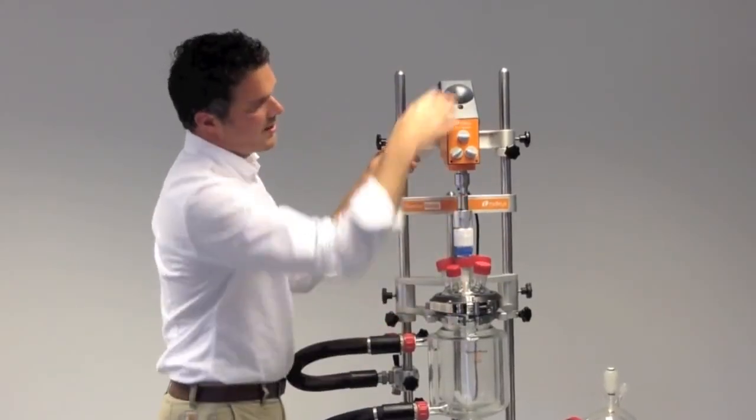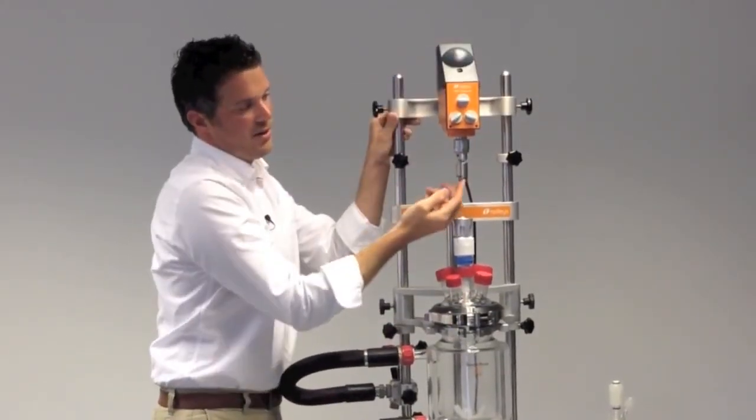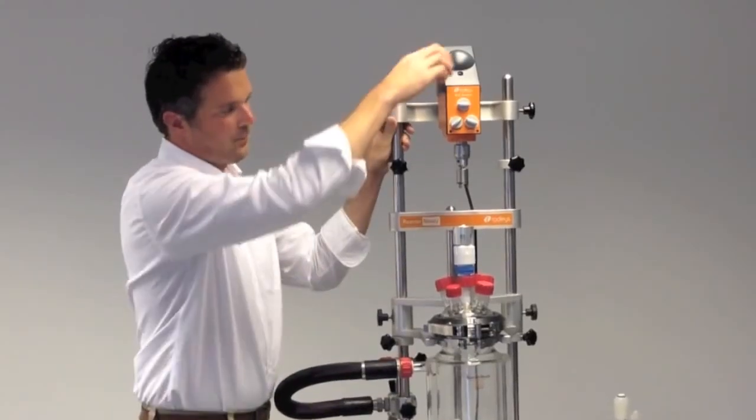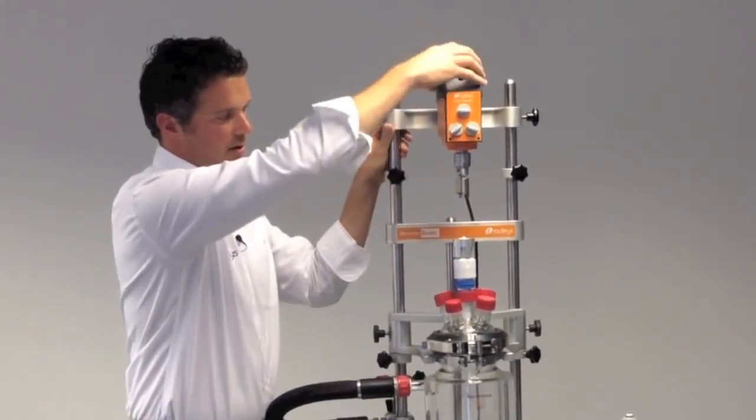Once you've undone the sides, this just slides up and you can see here is the three-pin drop-in coupling. You don't need any tools; this is what connects it to the stirrer shaft.